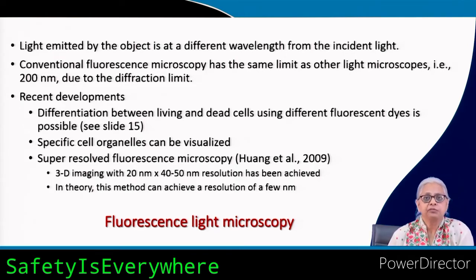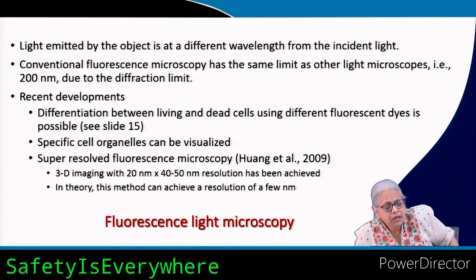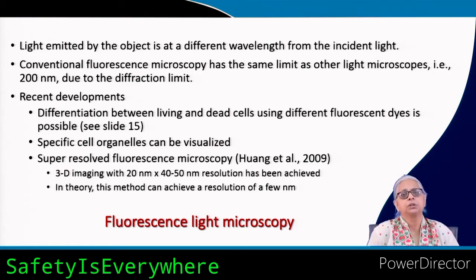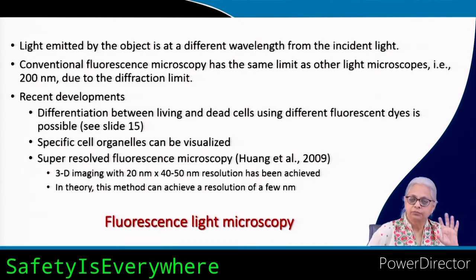So some of you may be familiar with the natural fluorescence of chlorophyll. Now, we know that under sunlight conditions, if any cell has chlorophyll in it, it looks green. We are all familiar with algae and so on. In our environments, including plants, all of them have a green color because of the presence of chlorophyll molecules. Now, when I see an object as green, it means that the light can do various things.